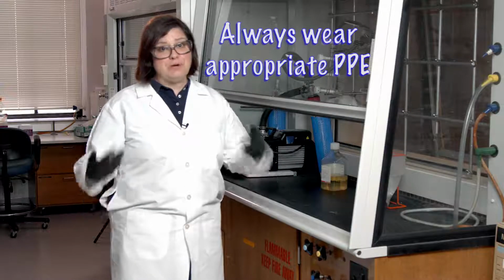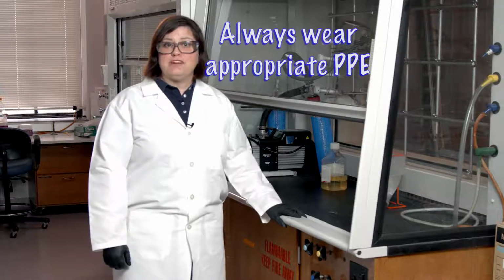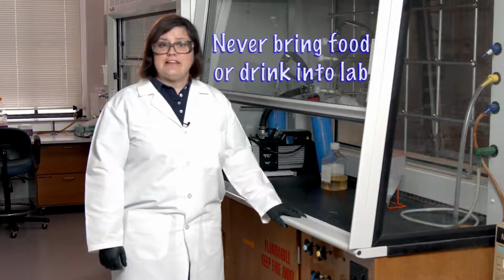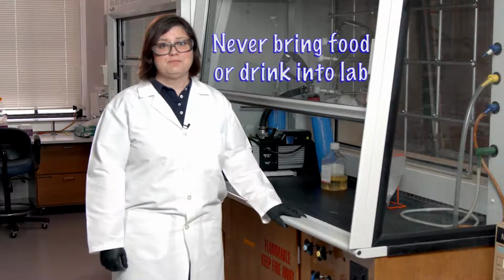During this brief introduction to general lab safety, I want to remind you of a few lab rules. First of all, always wear your personal protective equipment, or PPE. We'll go over in more detail later of what to wear and when. And of course, never bring food or drink into the laboratory. Lab refrigerators and microwaves should be dedicated to lab use only.